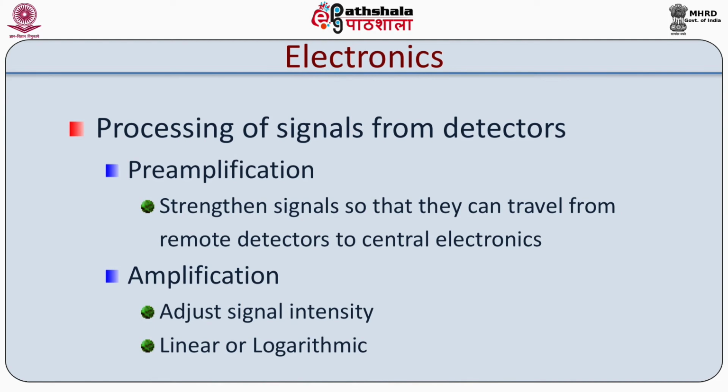The size of the voltage pulse depends on the number of photons detected, the PMT voltage or the pre-amplifier gain, and the amplifier gain. Signals are amplified by applying a voltage to these PMTs and creating a greater electrical current, or by increasing the amplification gain.